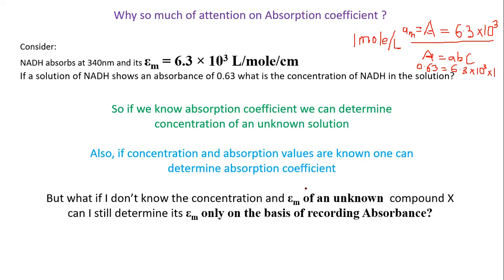So chemicals have specific absorbance, no? So by recording the absorbance, we can try to identify the range and the compound. Can you elaborate? I didn't understand it properly. What are you trying to say? Yes, sir. I was saying that every compound has a specific range of absorbance, no? For what we are trying to find.